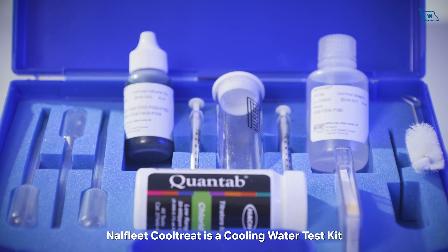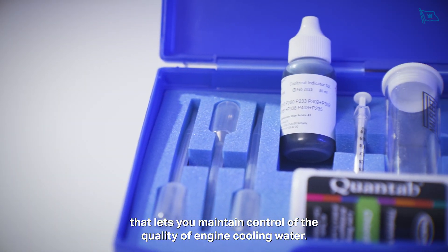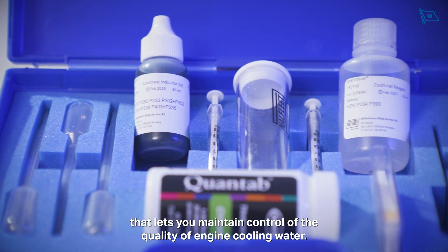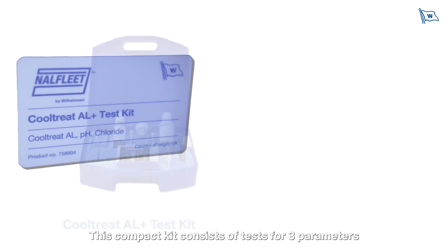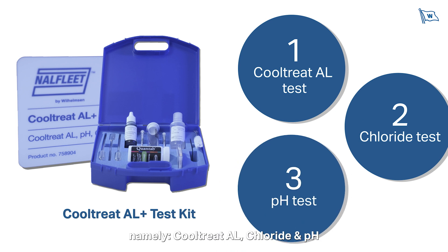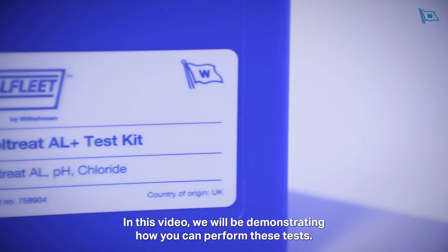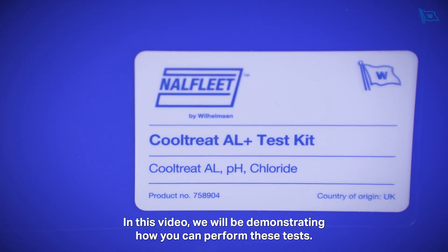Nalfleet Cooltreat is a cooling water test kit that lets you maintain control of the quality of engine cooling water. This compact kit consists of tests for three parameters, namely Cooltreat AL, Chloride, and pH. In this video we'll be demonstrating how you can perform these tests.